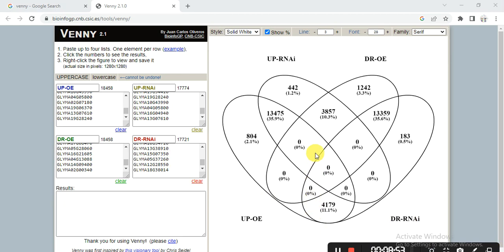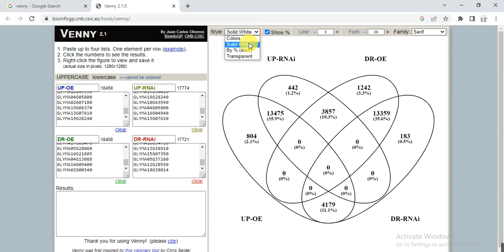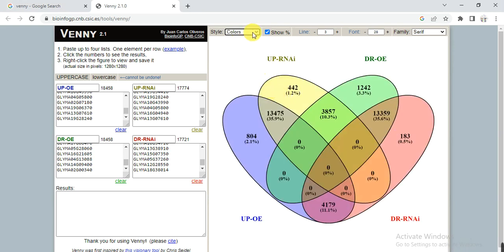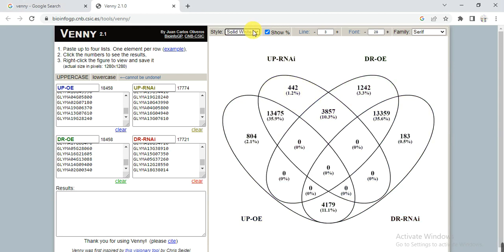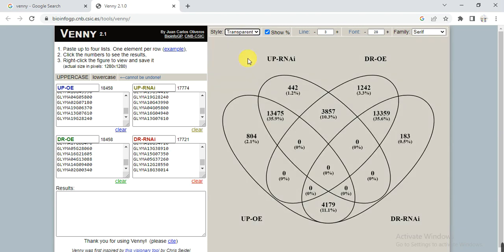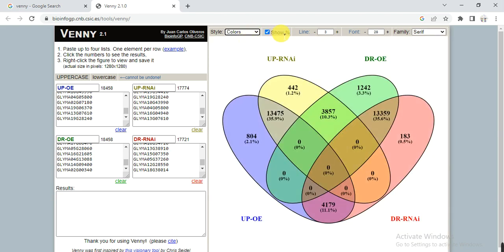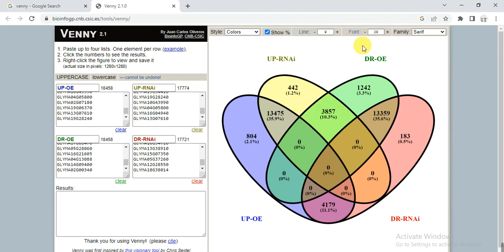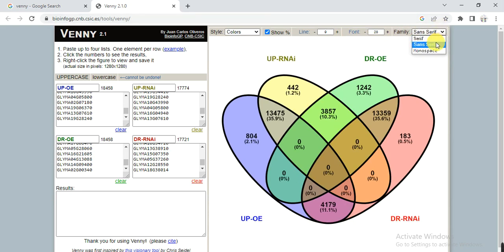In this way we can build our Venn diagram. You can change its style — solid, white — or change colors. It gives beautiful colors, or white, or show as percentage, whatever you want. You can also adjust transparency, font size, and line thickness to make these visual changes.